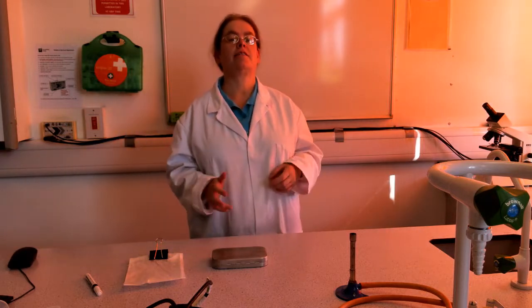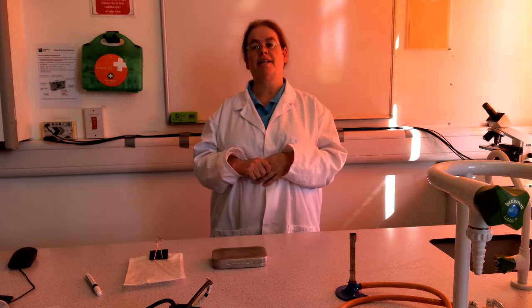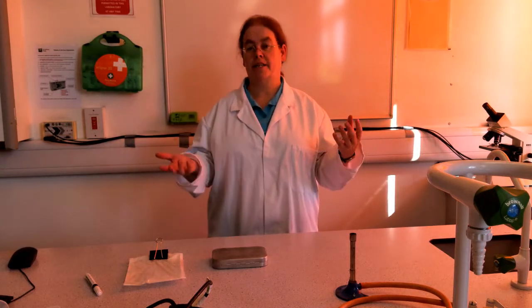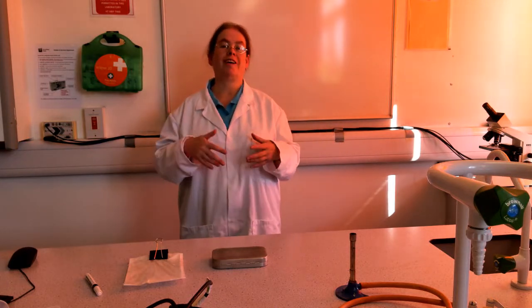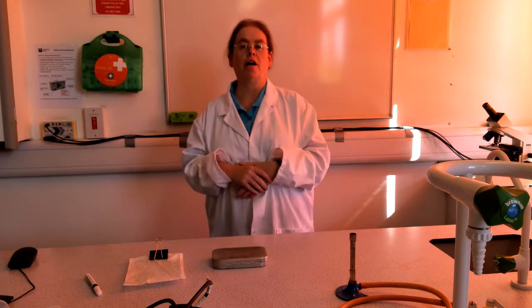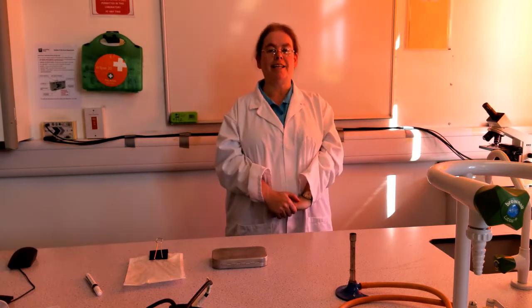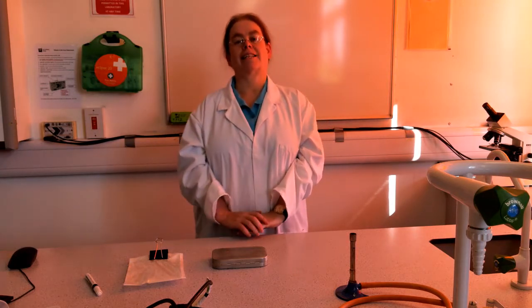And knowing that is often important if we want to know how badly contaminated something is, if we are investigating what's the best growth medium for a particular type of bacteria, if we want to find the best temperature, whatever, for growing our bacteria. We're going to want to try various things and then find out how many bacteria per milliliter are in our culture. Now, there are classically 4 ways of doing this.